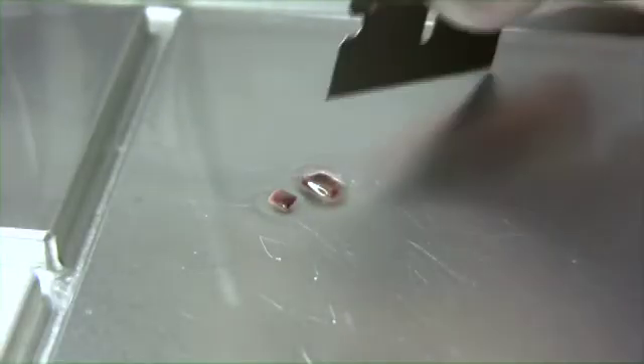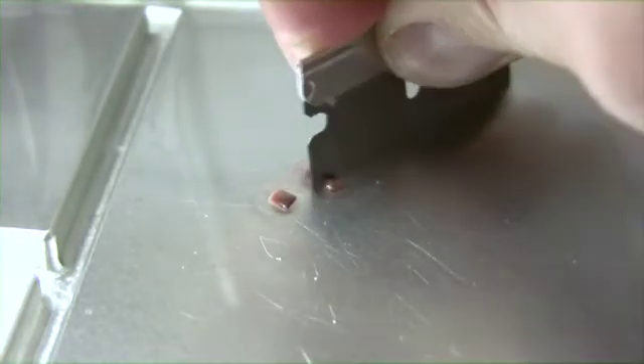Before I re-embed the samples, I need to make sure that they are basically the same size when I stand them on end.